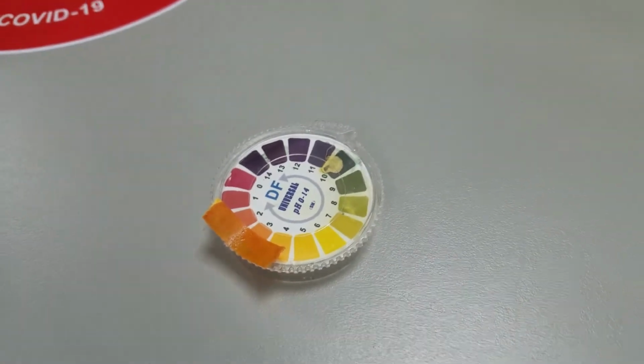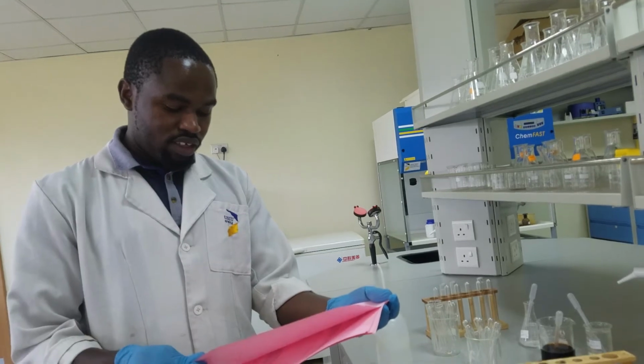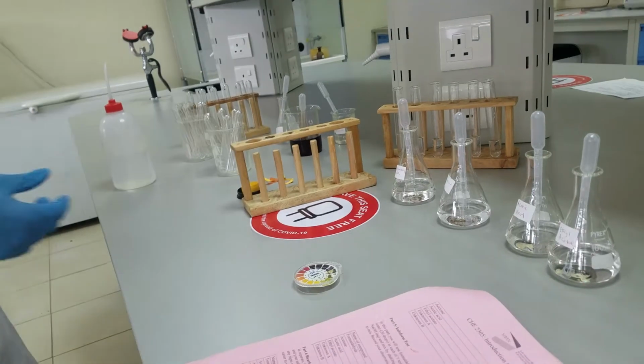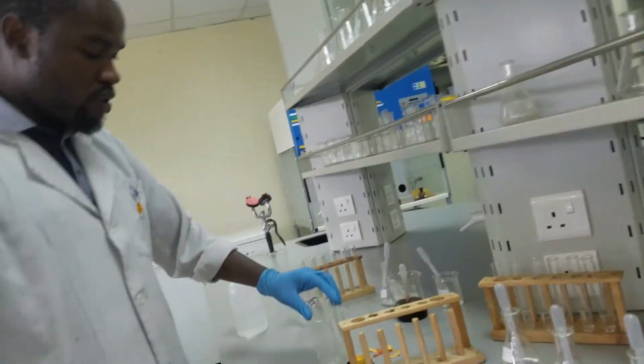Okay, so maybe acidity has helped you identify one or both of our unknowns. If not, we'll go to the other part, which is the iodoform test, to see if we can still identify our unknowns.